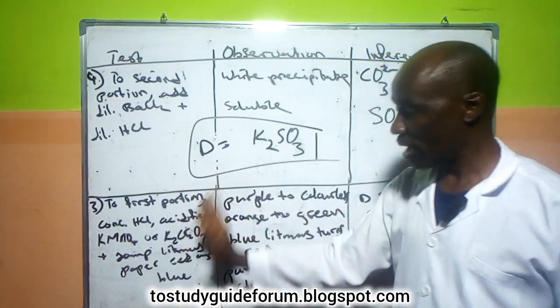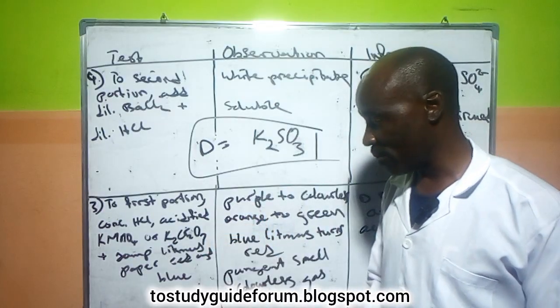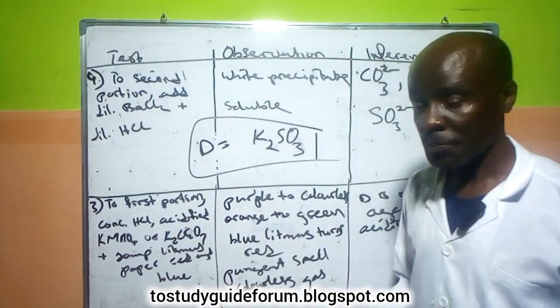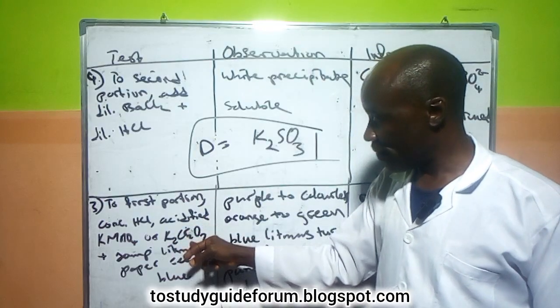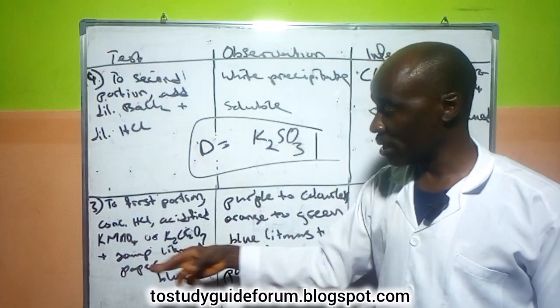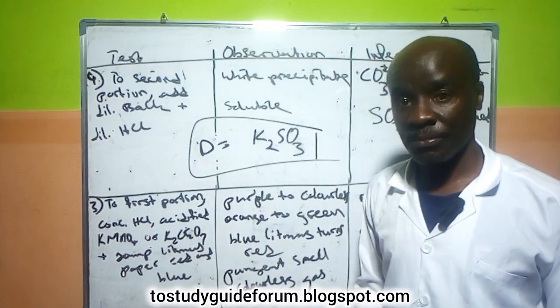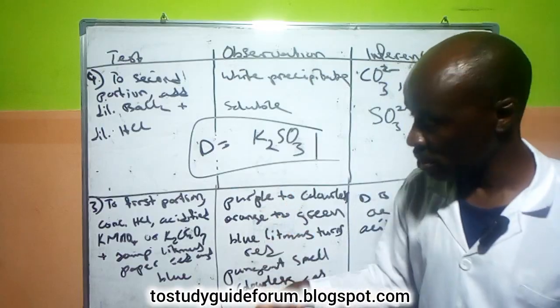So what I did was I just added them together. Actually, it's even what I wrote here based on my analysis. When I added it together, acidified this, and poured into the bubbles that are coming out here, automatically the whole solution turned green while the gas was still coming out. There's an effervescence taking place there.